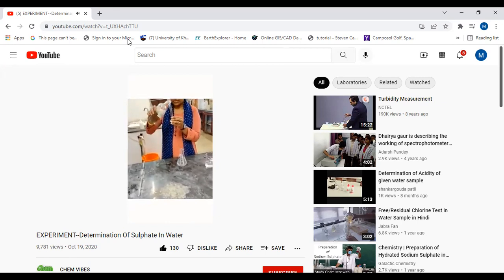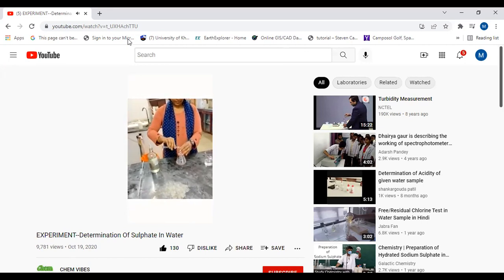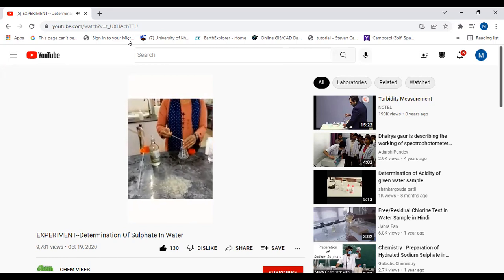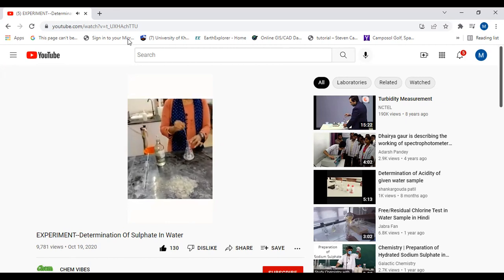Conditioning reagent, and mix in the stirring apparatus. Add a spoonful of barium chloride crystals and begin to measure time immediately. Stir at a constant speed by using a glass rod.